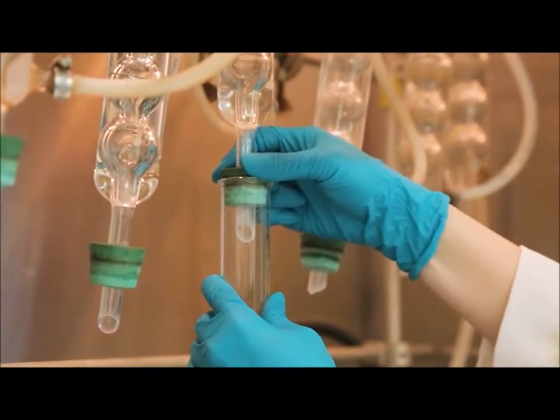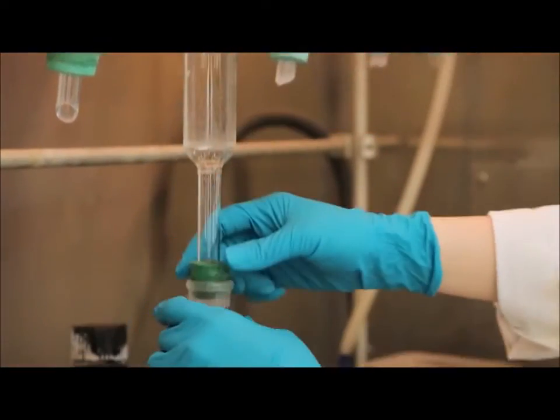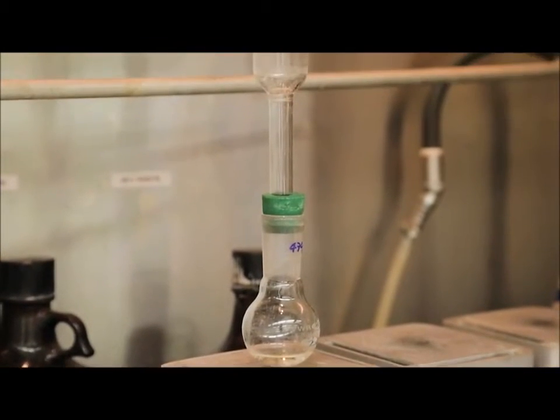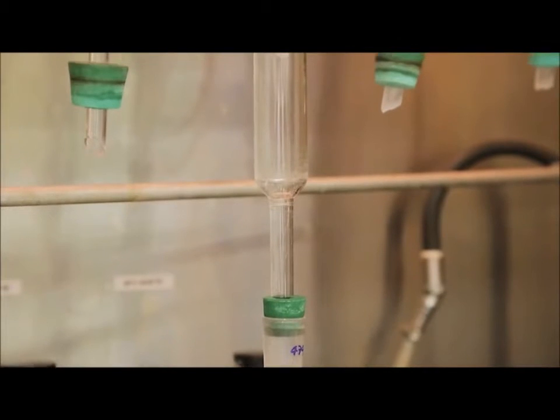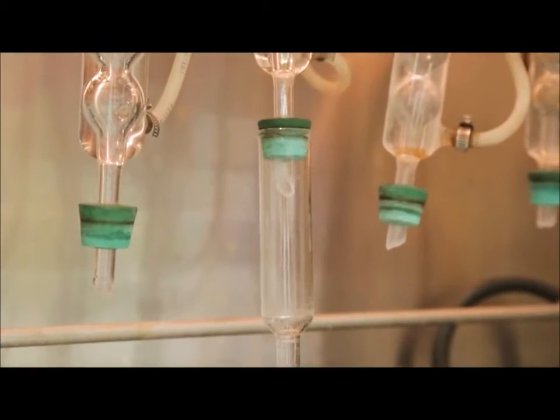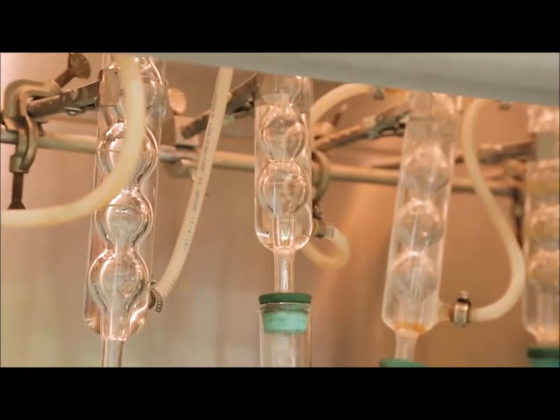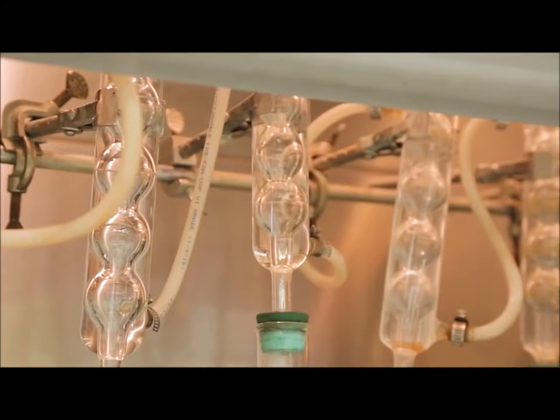It is important to allow the sample to boil for at least 20 minutes. During the boiling process, you will see the sample actively refluxing. So you will see the methanol evaporating and then condensing in the connectors and then dripping back down into the flask.